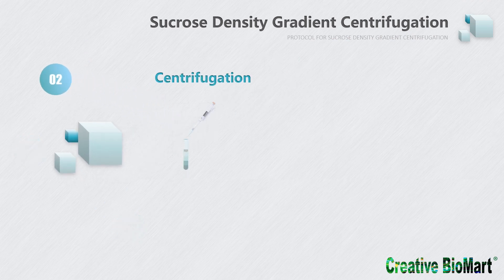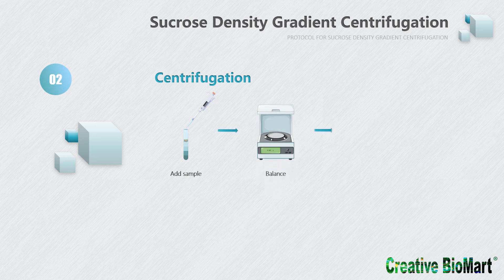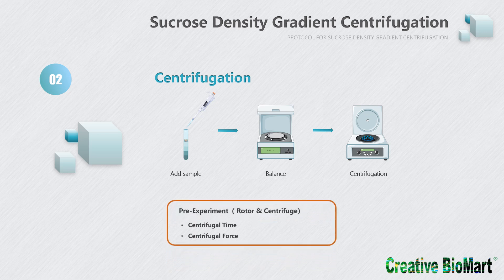After the gradients are prepared, carefully add the sample solution to the top of the gradients. If the density of the sample solution is close to the density of one gradient layer, you can mix the sample with that gradient solution before gradient preparation. Weigh the centrifuge tubes with the sample before centrifugation to ensure the weights are balanced. Because centrifuge and rotor conditions differ between experiments, a pre-experiment is required to determine the optimal centrifugation time to ensure the sample does not settle to the bottom. It is also better to measure the sample concentration, as it may affect the resolution of the bands. After centrifugation, samples in the gradient are separated into different bands according to their sedimentation coefficients.